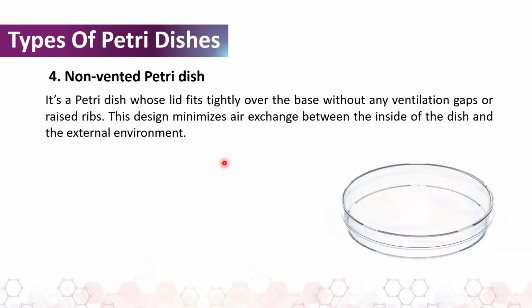The next is the non-vented Petri dish, and this is a picture of it. It is a Petri dish whose lid fits tightly over the base without any ventilation gaps or raised ribs. And this is purposely designed to minimize air exchange between the inside of the dish and the external environment.